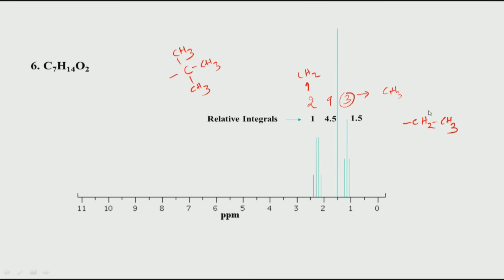So, these 2 protons we expect to give a quartet, and that is what is here, and similarly this CH3, when it is coupled to 2 protons, you expect to get a triplet, and that is this peak. So whenever you see a triplet and a quartet, you typically expect this particular system. And because this is coming in the zone between 0 to 2.5, it is not directly attached; there is no direct oxygen here.